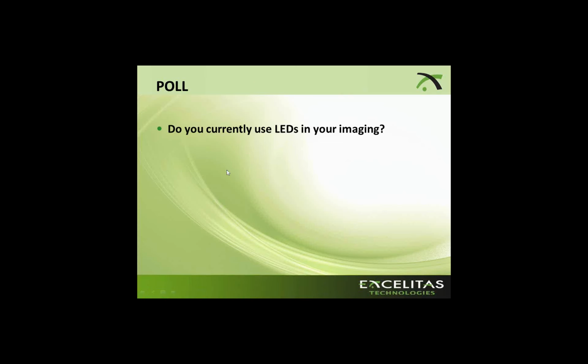Thank you for that. So as far as lamps being used in fluorescence, the first commercially available HBO system, which is what they used to be called, was in the 1930s, around that time. Now, when I'm talking about lamps in fluorescence, I'm talking about HBOs, mercuries, and metal halides, because there are several terms that describe the basic bulb format to excite fluorescence. They have been used for a long, long time, and they have a wide spectrum and very high power.